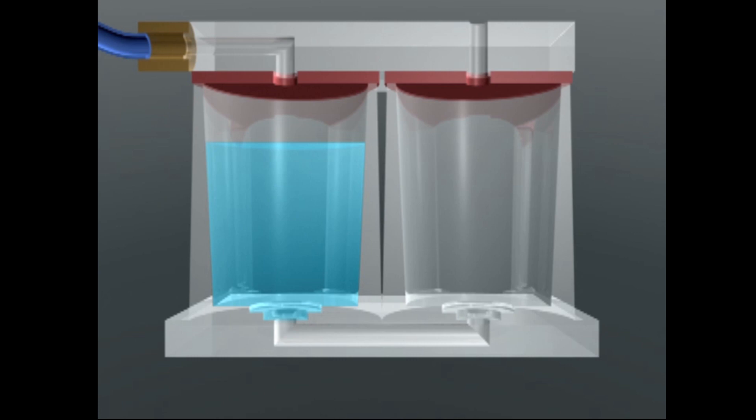Once the well sees this increased pressure, the reagent will flow through the port at the bottom of the well and along the direction of the flow channel. Once the reagent clears the flow channel, it will begin to pull up in the output well.